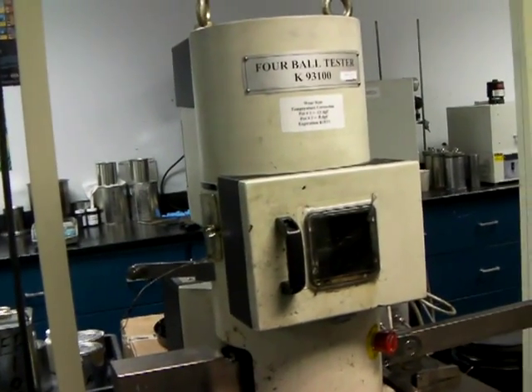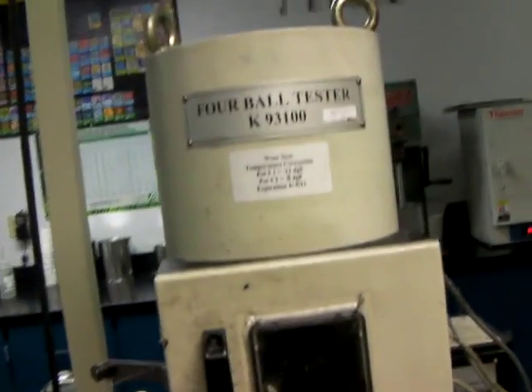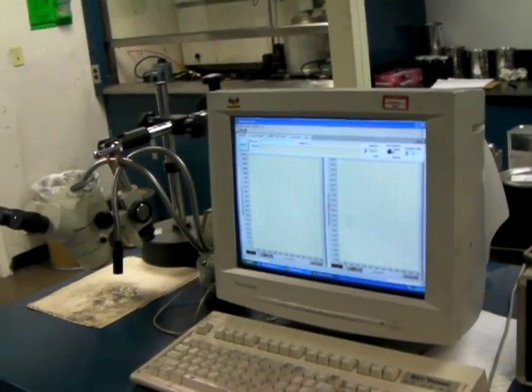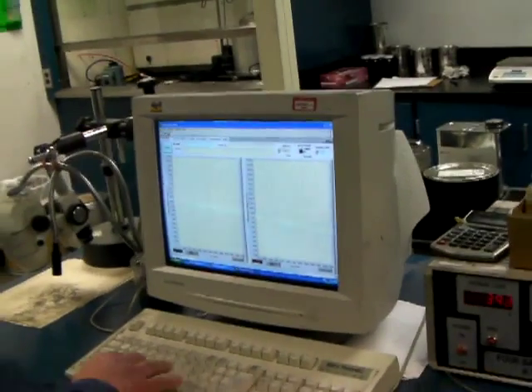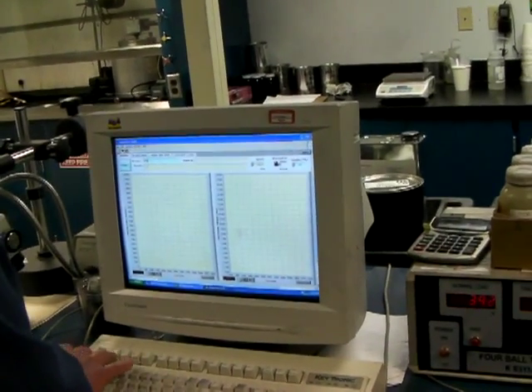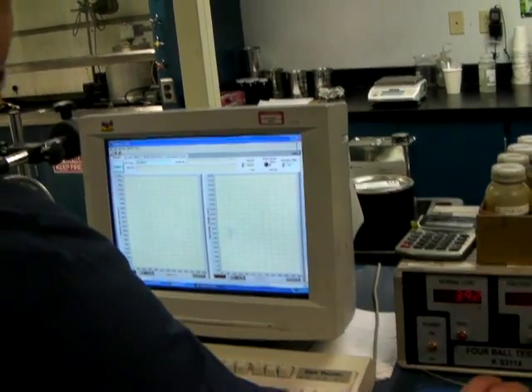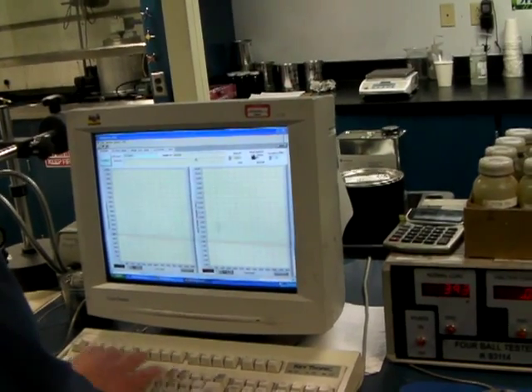All we're showing in this video is just the setup — what it looks like. At the computer, I'm going to set up to check the coefficient of friction on the sample at the same time. So while it's running, this will measure the friction level. That's an additional option. The product in this case is Matrix.